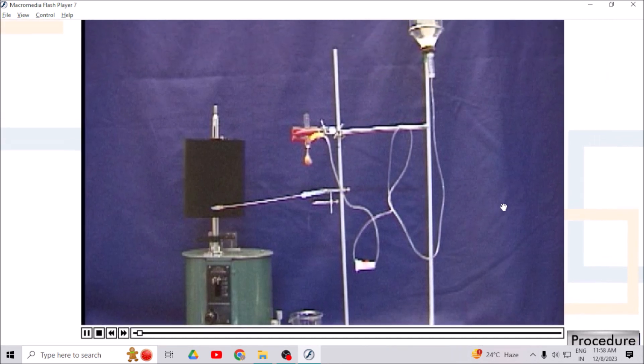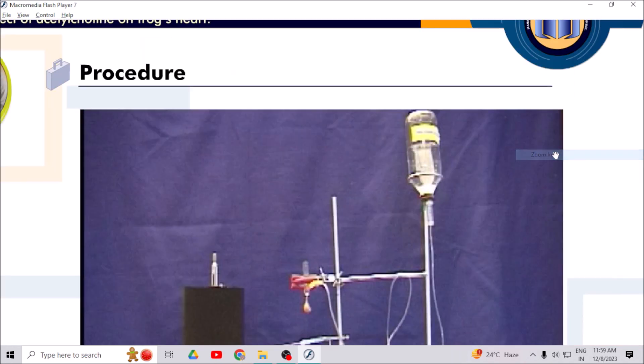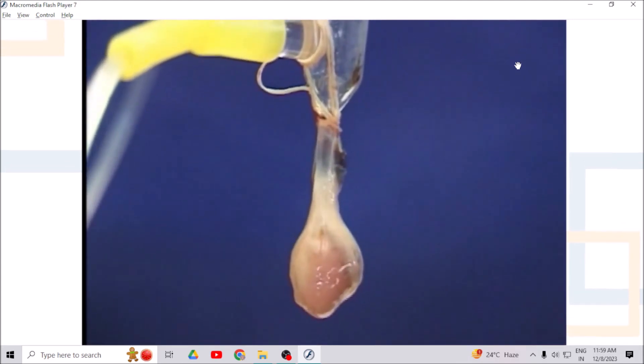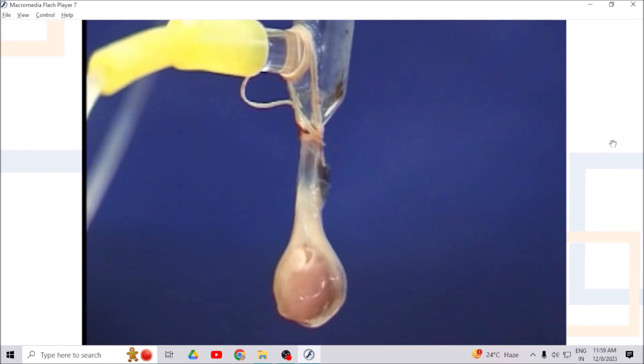We have already learned the isolation technique of frog's heart preparation. To study the effect of acetylcholine on frog's heart, perfuse the heart with frog Ringer solution.